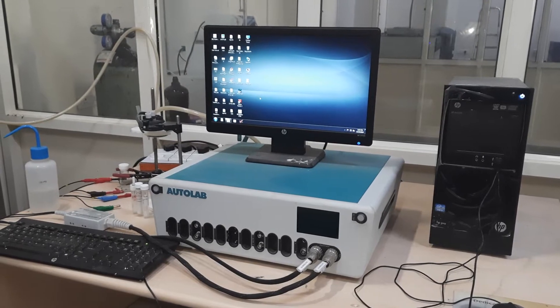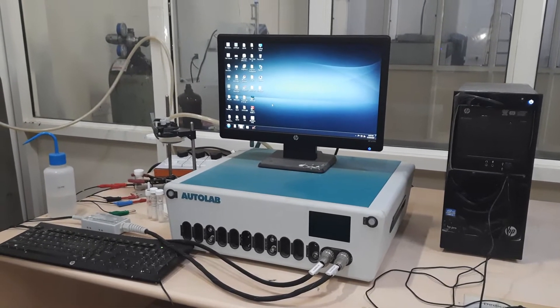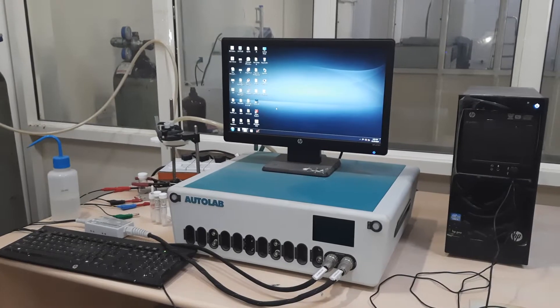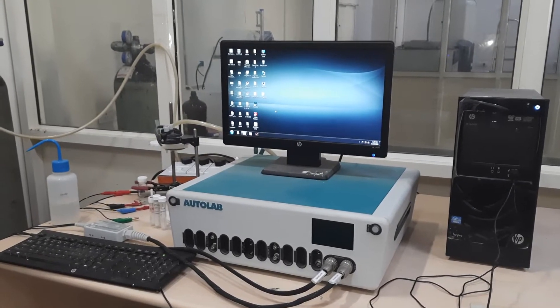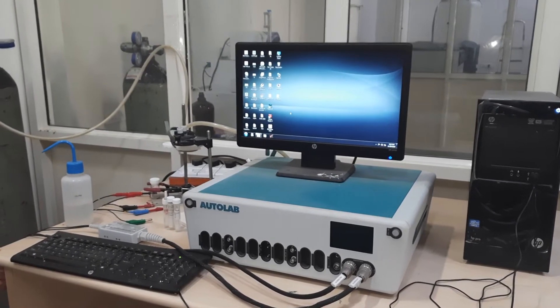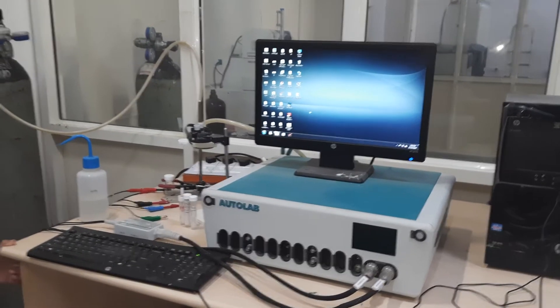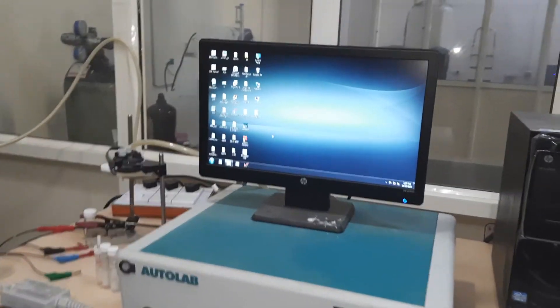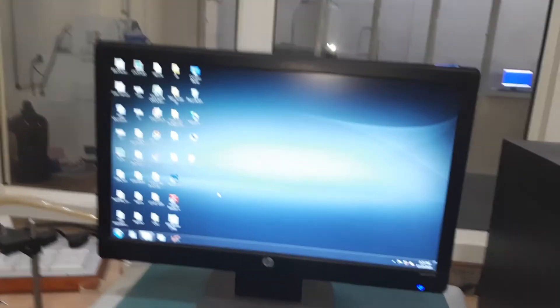It is also used for handling the data once we have recorded.